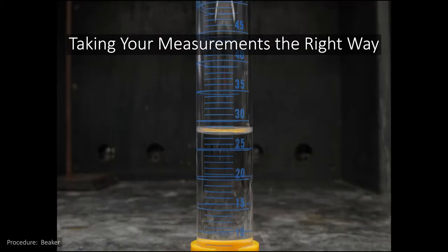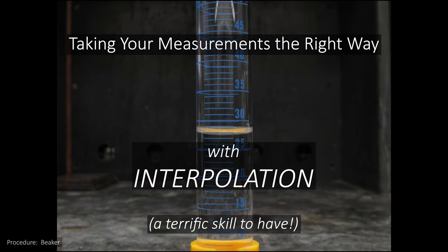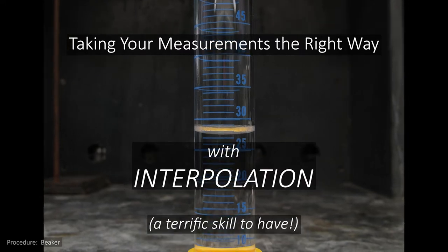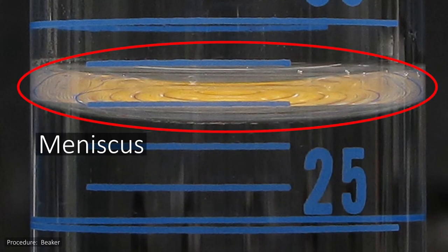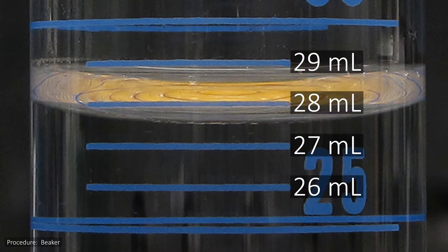Taking the measurements you'll need for the beaker will be a relatively straightforward process, though there is something you'll need to know about in order to read it properly, and that something is interpolation. To show you how this works, I've got a graduated cylinder here with some water in it, and you can see the bottom of the meniscus, that's the curvy shape the top of the water takes, the bottom of the meniscus falls somewhere between the 27 and 28 milliliter marks.